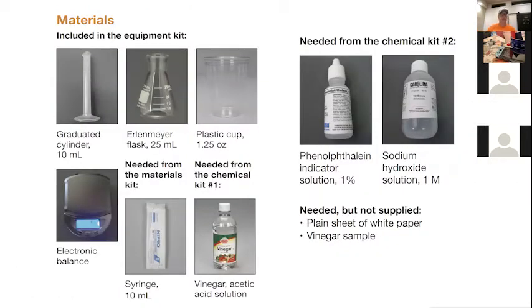So this is the stuff we're going to be using tonight. So we need a graduated cylinder, make sure the Erlenmeyer flask is clean.